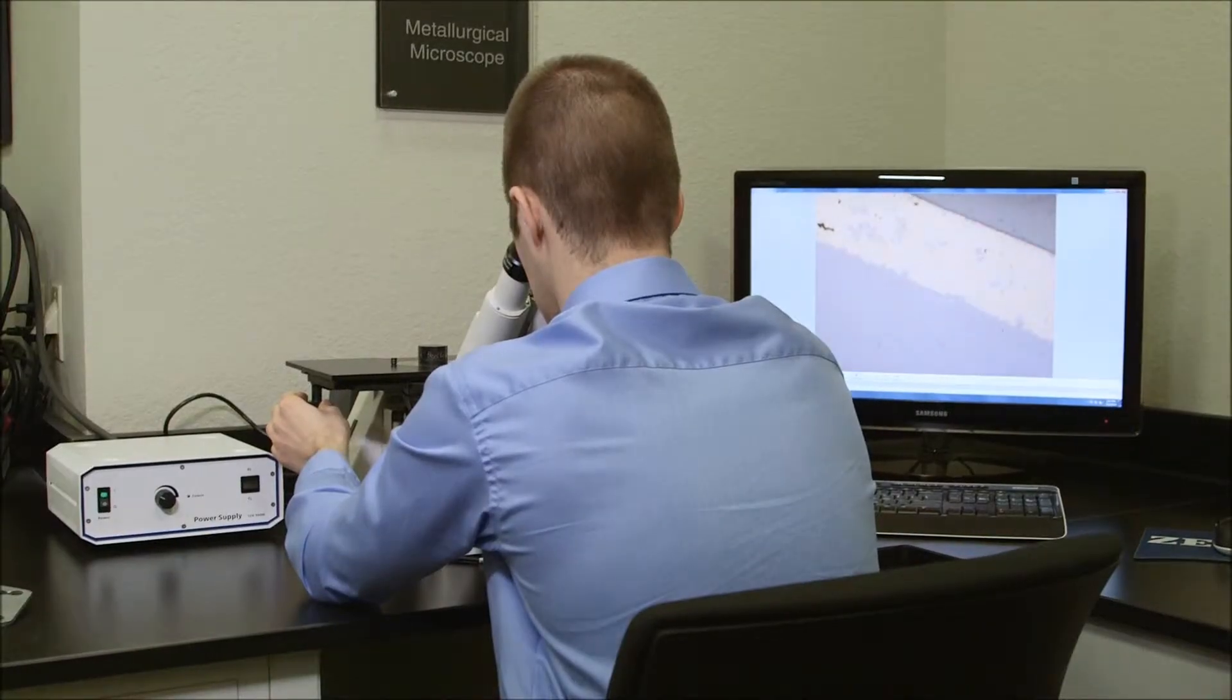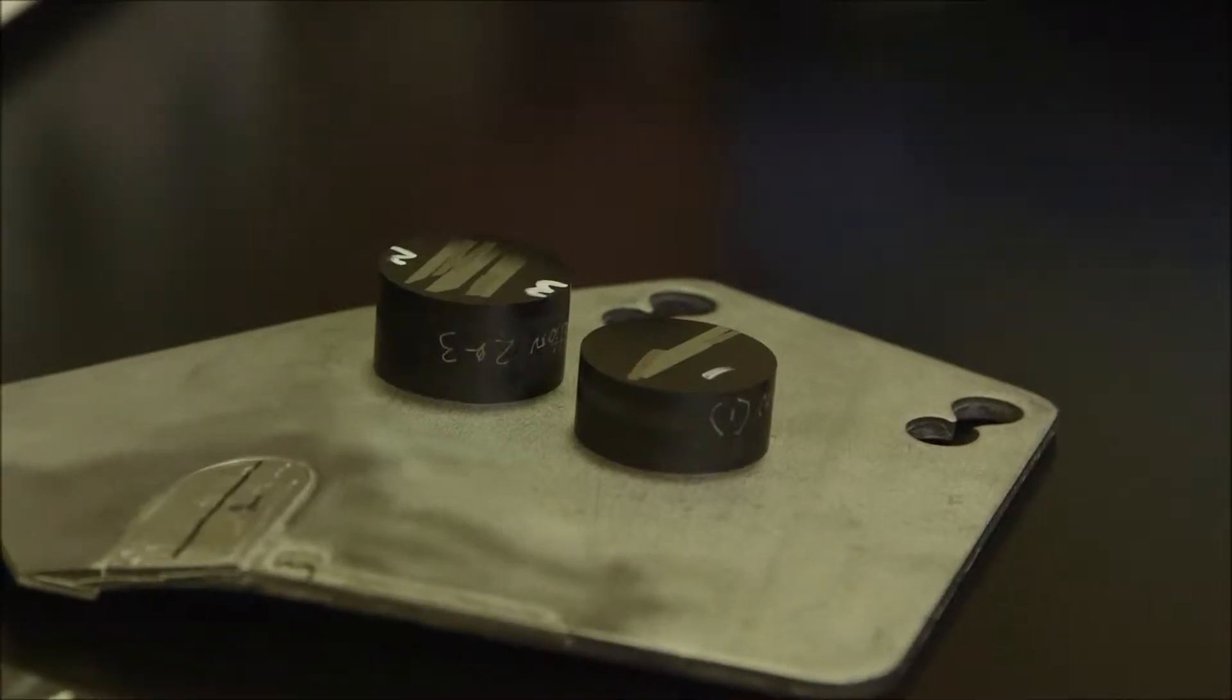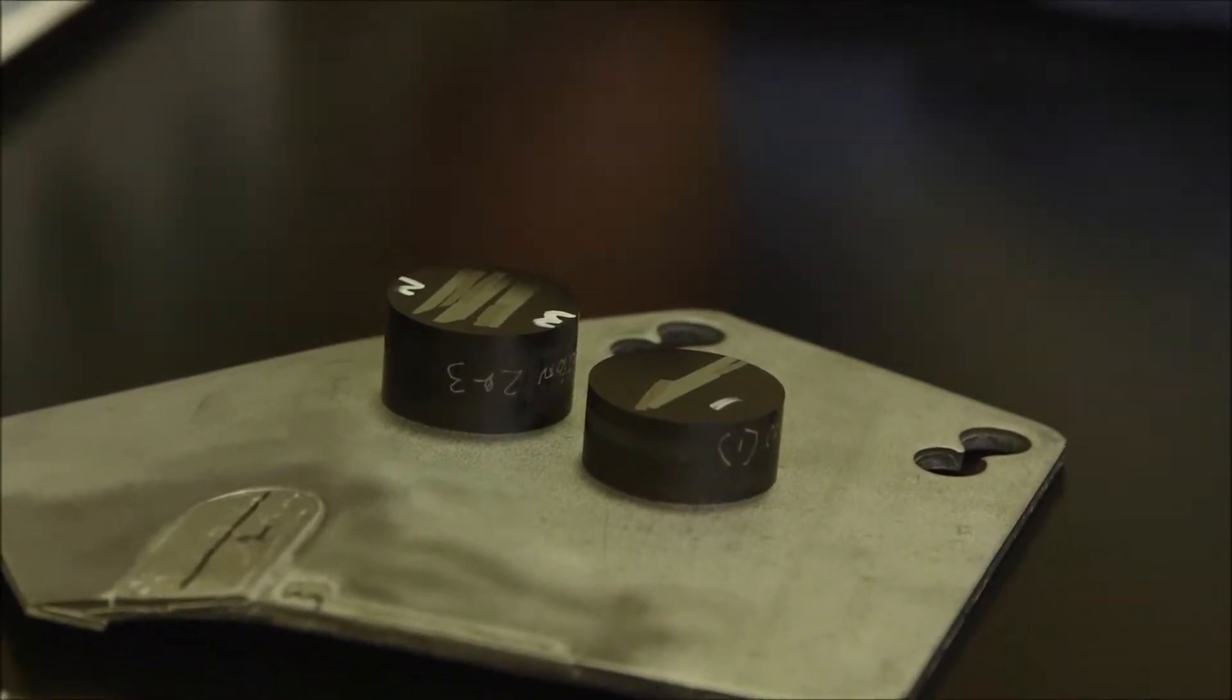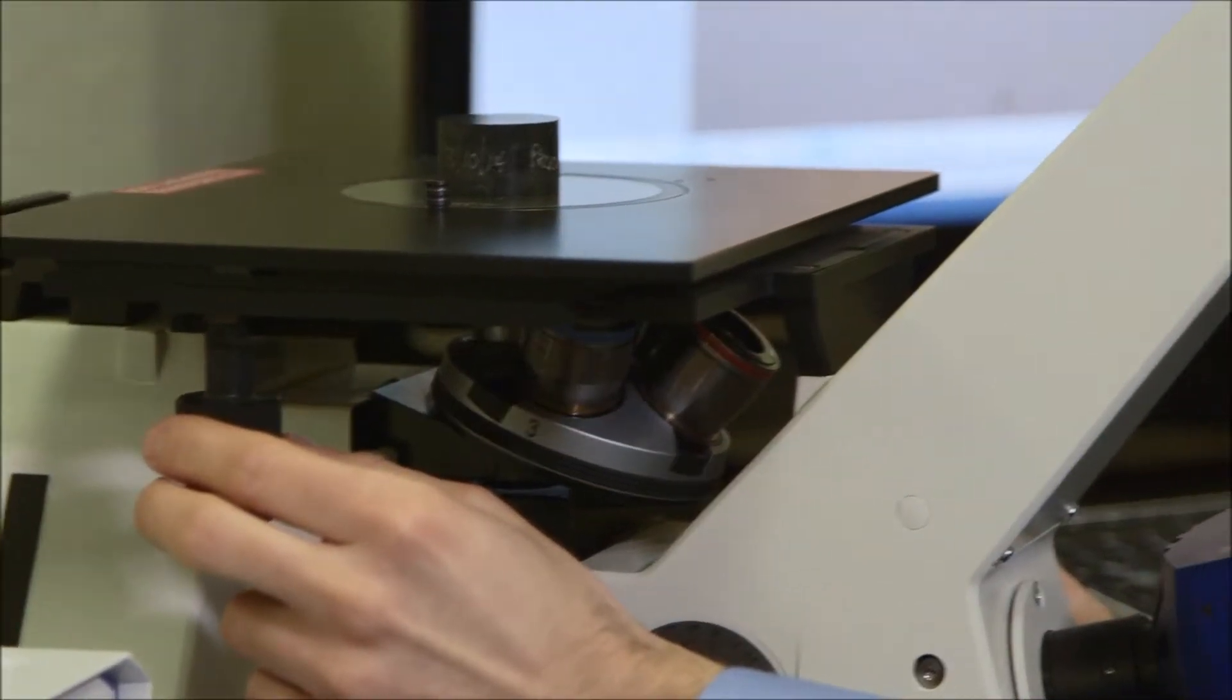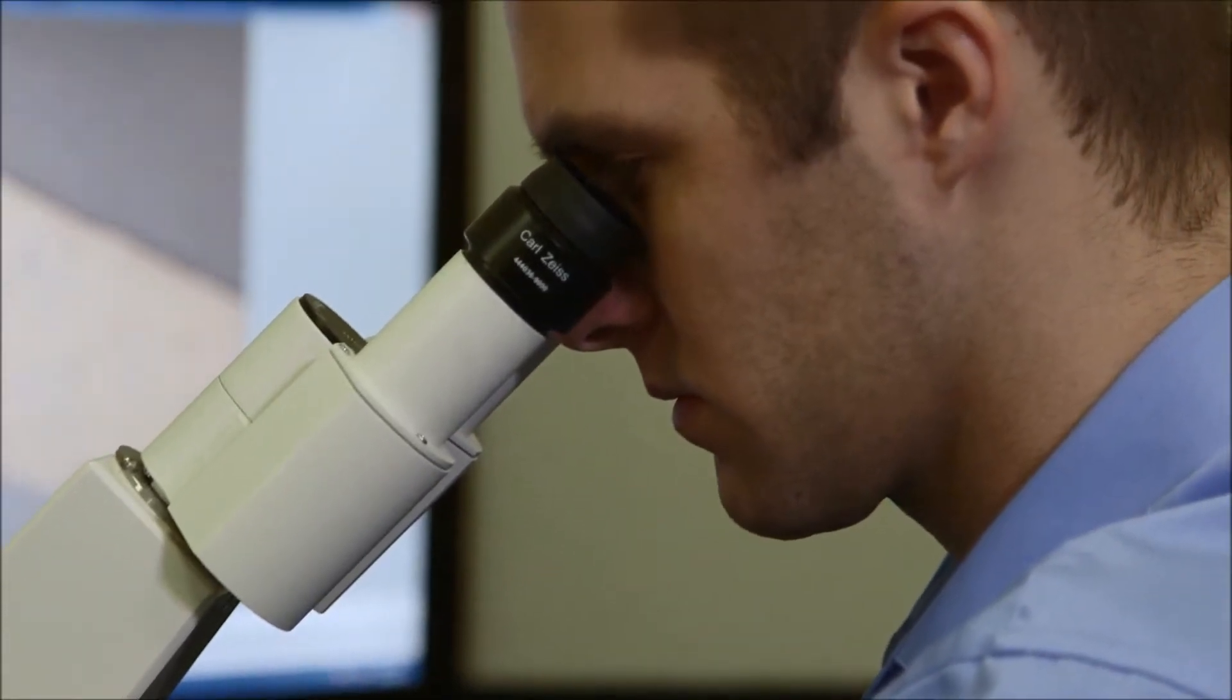Another very important part of metallurgical analysis is the analysis that we do on microstructures. And in order to do this, we use a Zeiss Axiovert 40 microscope that's used to look at mounted and polished specimens. And what we can do in our mechanical testing room is we can actually prepare specimens to a mirror finish, we can etch them, and then we can look at the revealing microstructure underneath our inverted metallograph microscope that we have.